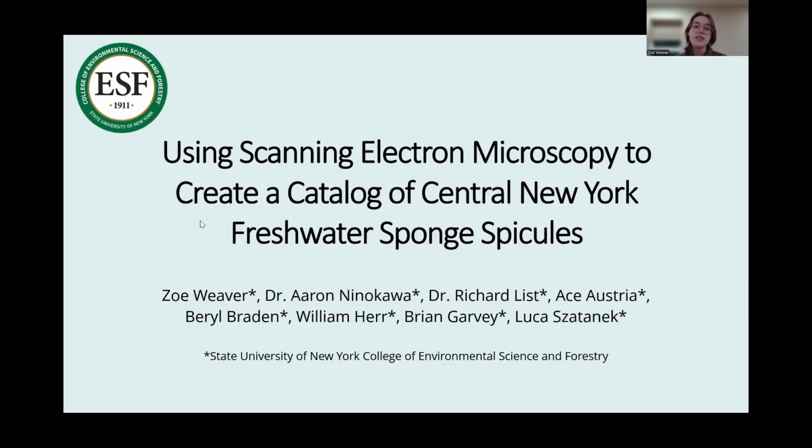applications. In the past, catalogs have been made for the surrounding areas, such as eastern Canada and western Pennsylvania, but there hasn't been one made yet for the central New York region. Making this catalog allows more specific studies to be done in this area. So I'll be focusing on our methods and the applications of what we have acquired so far, and how we're going to move on from here.